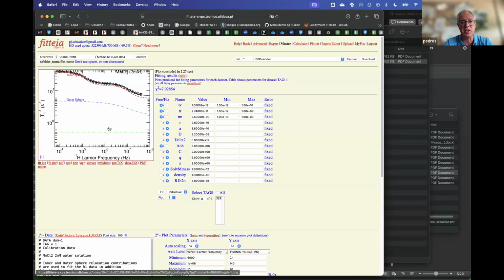And this can only be achieved if the user has the possibility to see the components independently. So this is an important feature that I should stress, and I invite users to look for it in other software packages, because they should implement it, in my opinion.